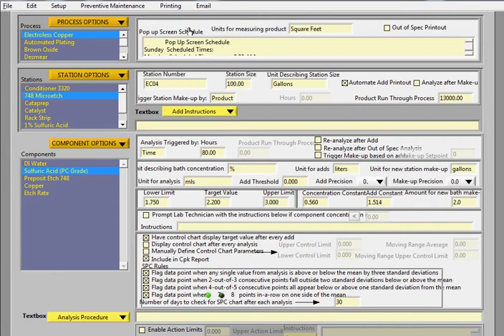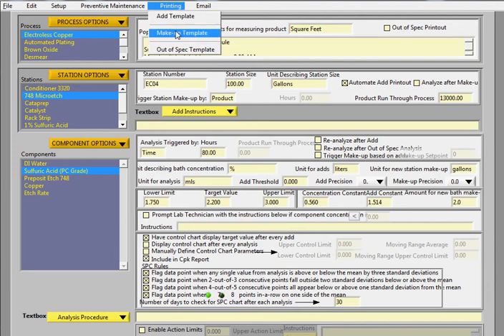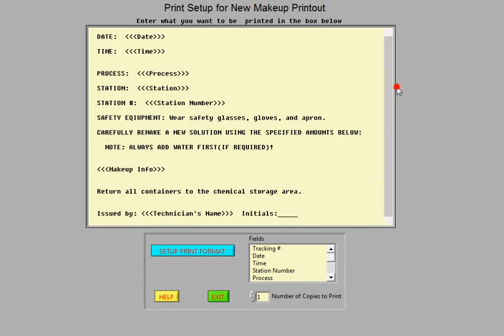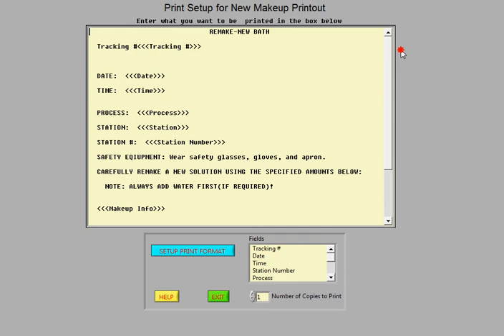Another nice feature is the makeup template. And again, you have fields with triple brackets around them that you can use and place wherever you want to. In this makeup template, it shows, again, similar fields, date, time, process, station, safety equipment.